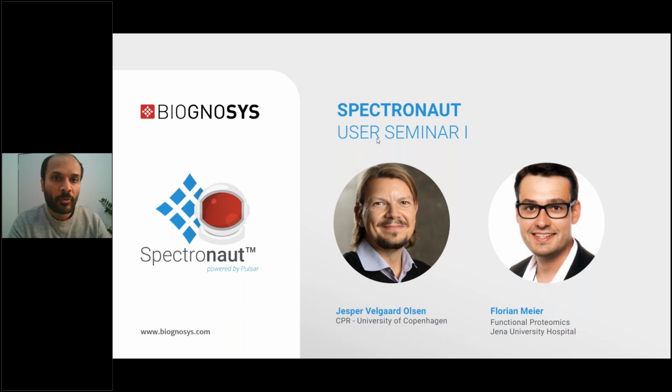I did my PhD at the University of Groningen in the Netherlands, and I've been part of the R&D bioinformatics team here at Biognosys for the past several years. I'm very excited about our lineup today. While it was not exactly planned, both of our presenters will touch on the topic of doing proteomics with the latest yet different ion mobility-based technologies. Certainly one of the hot topics at this year's ASMS.